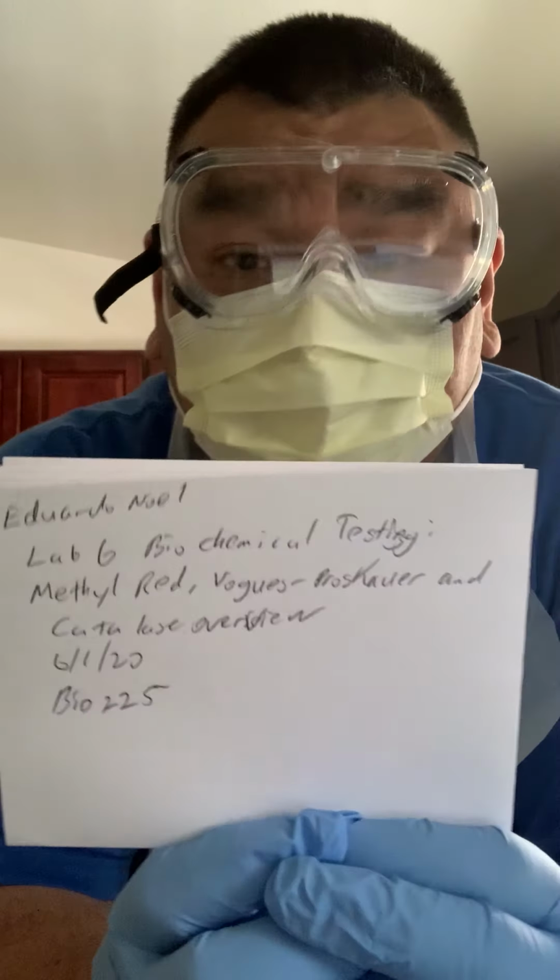This is week 4, lab 6, biochemical testing for methyl red, Voges-Proskauer, and catalase overview. It is June 1st, 2020 for Bio 225.